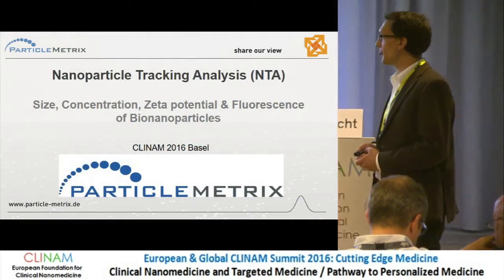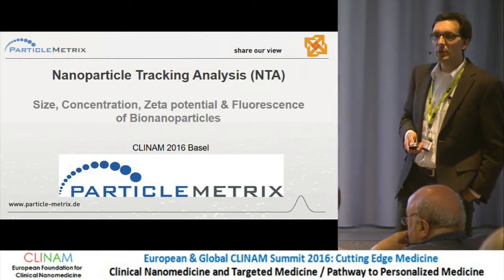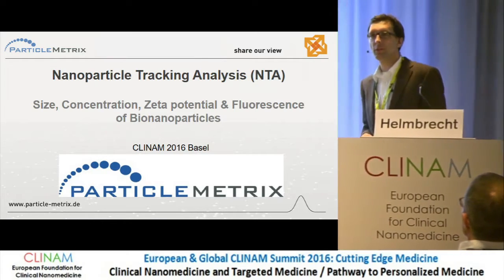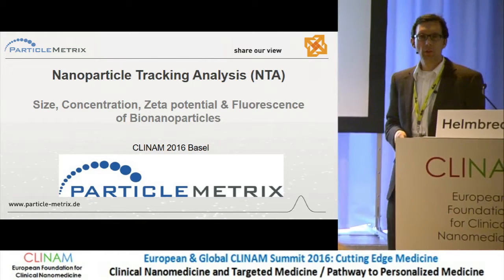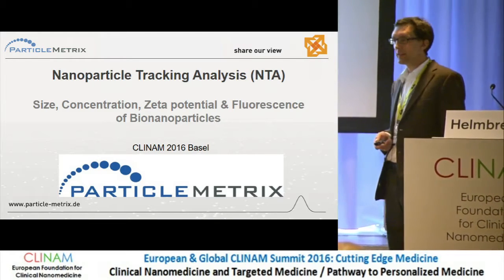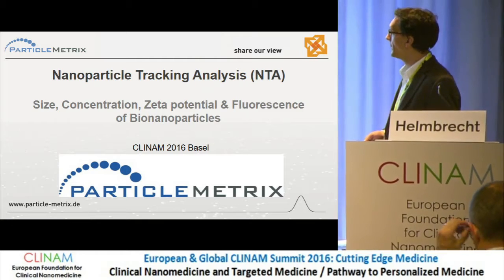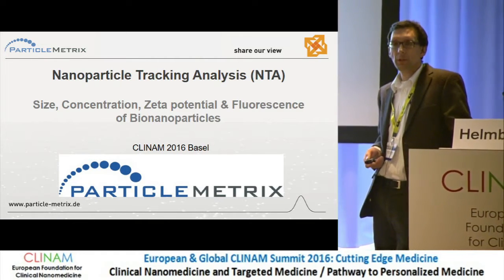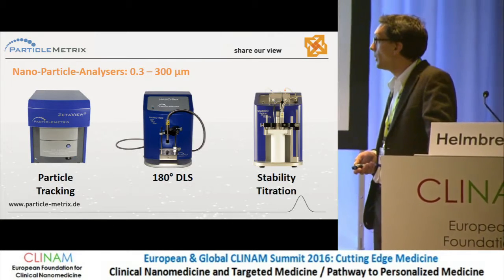Yeah, thanks a lot for the introduction. I'm going to talk in the next 12 minutes about another technique to analyze nanoparticles of various kinds, not only nanoparticles. You can also, of course, analyze gold or silicon dioxide, liposomes, any kind of nanoparticles with nanoparticle tracking analysis. One of the benefits of this technique is that it's a multi-parameter instrument, and we're going to show what it can do.